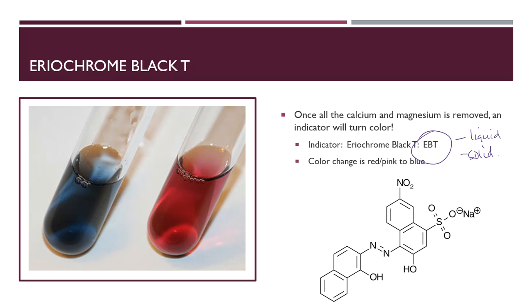And folks, what we're going to be using in this titration, because it's a little bit different than the traditional titrations that you've done so far, is just the solid indicator, just some powder. We give you some powder, we have you measure some of it out, knock it down into solution, and folks, you got it. There's your indicator.